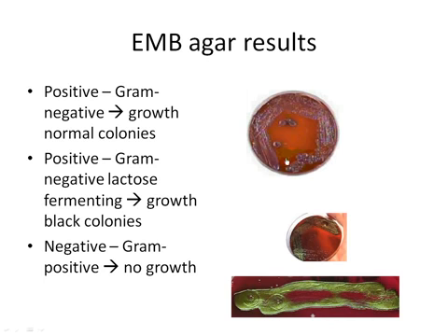In the top picture here, you can see the EMB agar itself is kind of a blood red, almost purplish color. The bacteria is growing on this plate. Therefore, we know that bacteria has to be gram-negative. In addition to growing, it has sort of a purplish black color to the bacteria itself. So that bacteria is a lactose fermenter.